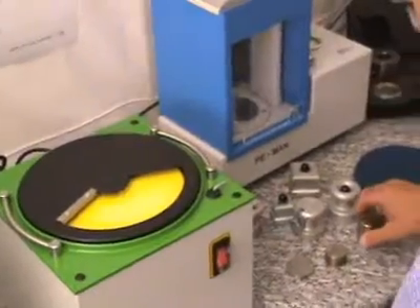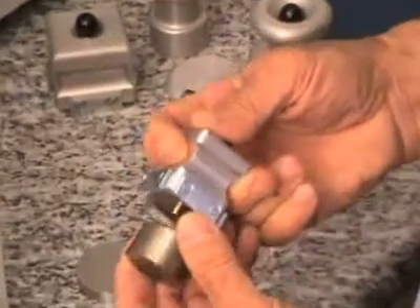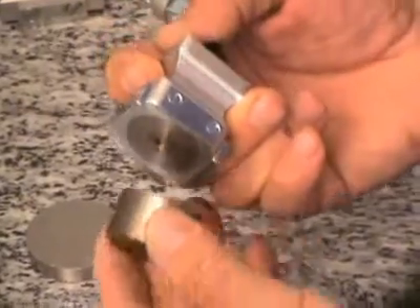If you have magnetic samples, especially smaller ones, you can hold these samples safely in a magnetic sample holder.